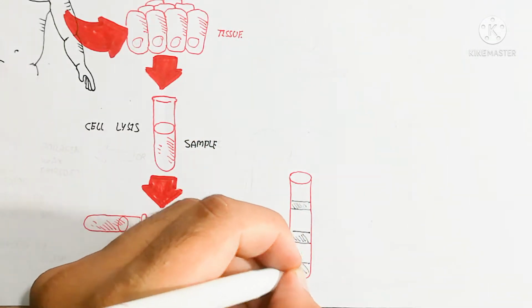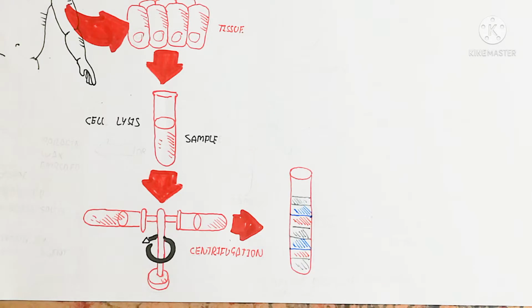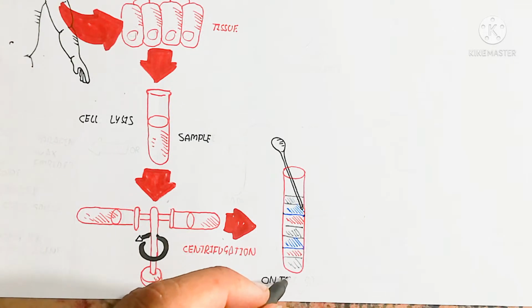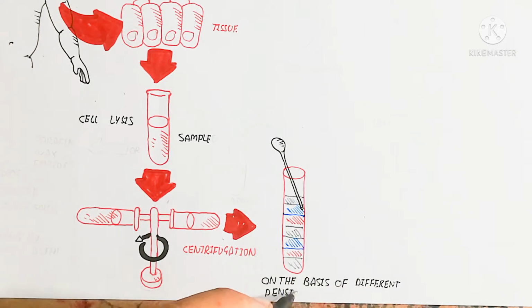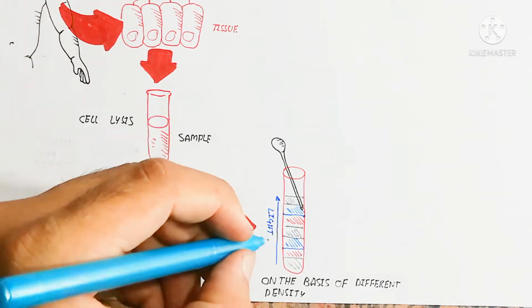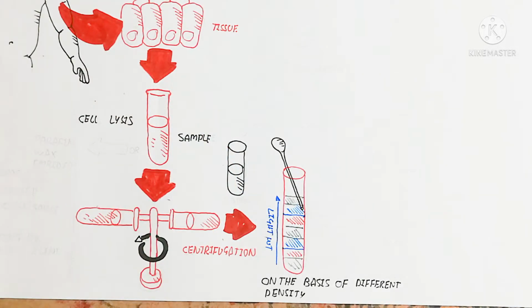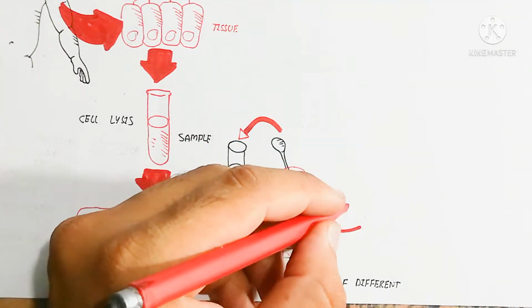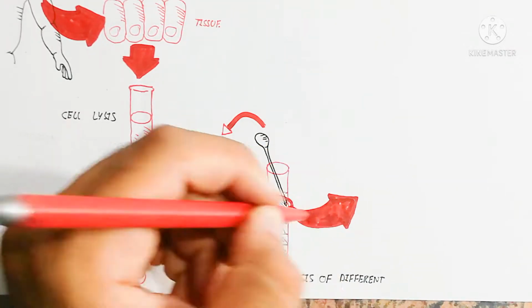Then we check the whole test tube at the different phases to get the sample, and put this sample drop-wise onto a slide with a cover slip. We check all the phases, and first we find the mitochondria and where the mitochondria are. Remember, this is the biotechnological technique to understand the separation of organelles. So we are checking mitochondrial identification and mitochondrial study.